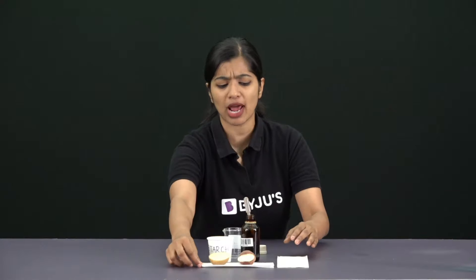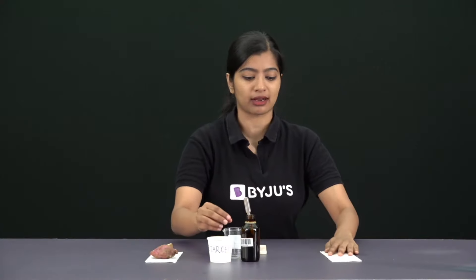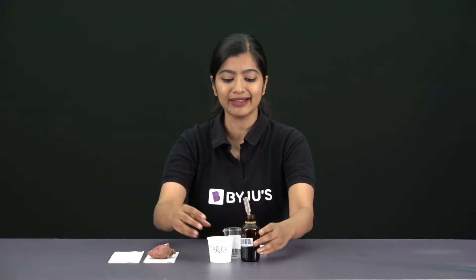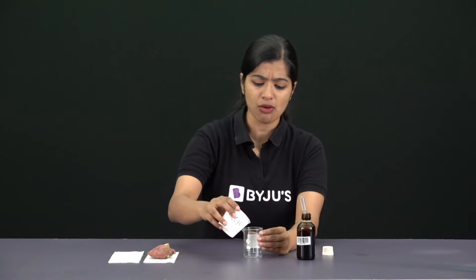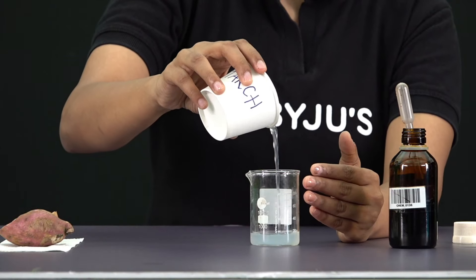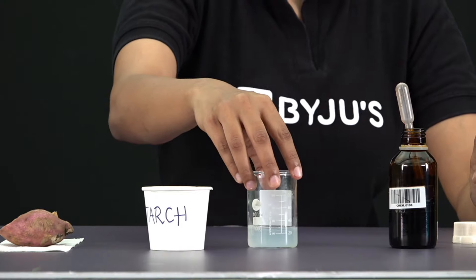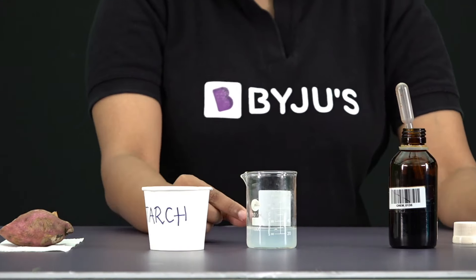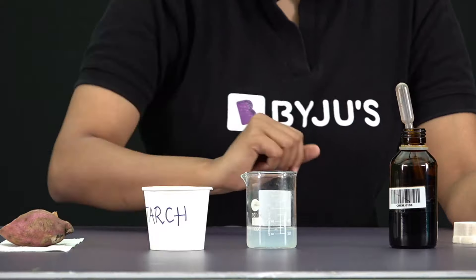Before we test on the food items, we need to visualize this blue-black color. So I have starch powder which I had dissolved in warm water, and it looks something like this. I have put it in a transparent beaker and if you notice, it is having a whitish color.